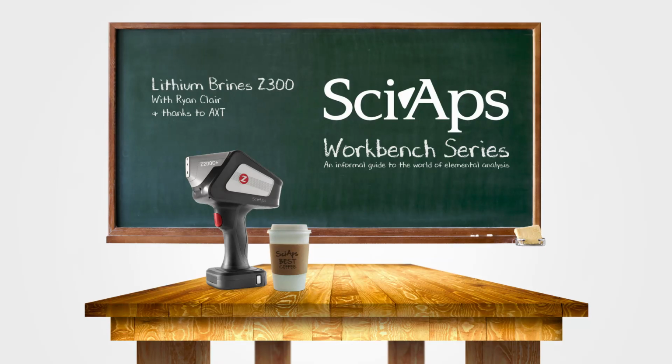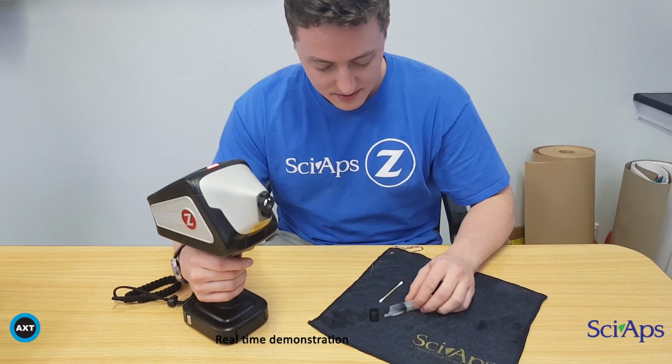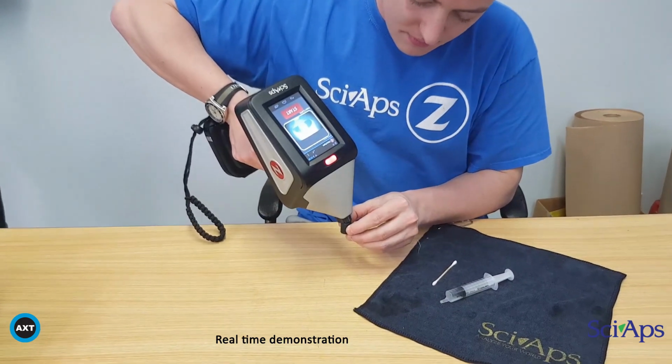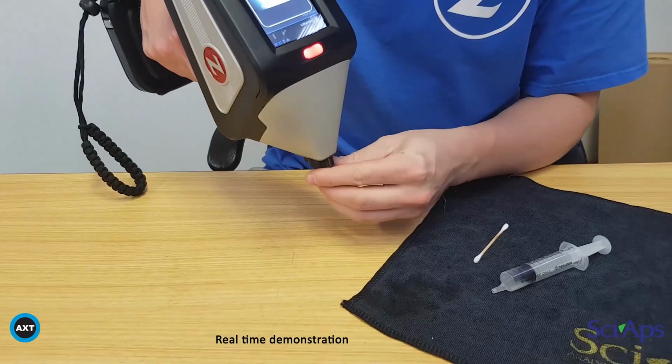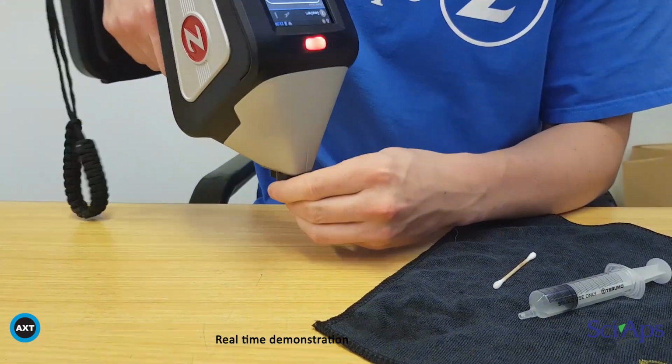Here's a quick video on lithium brines, calibrating and taking tests. Here we have the accessory kit, test stand, lab jack, and the hardware to fit on the nose plate, along with the vials and the positioner for the vials. Here I am filling a vial and using the Element Pro app or the Geochem app to take a test on a liquid brine and get a real-time result instantly.